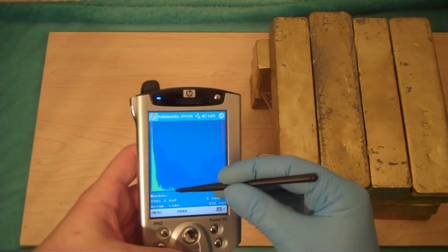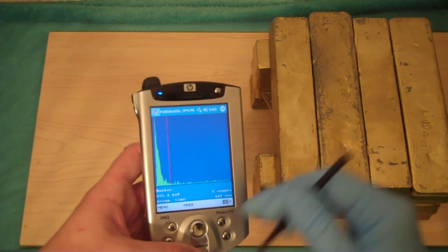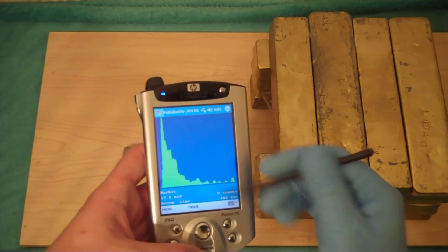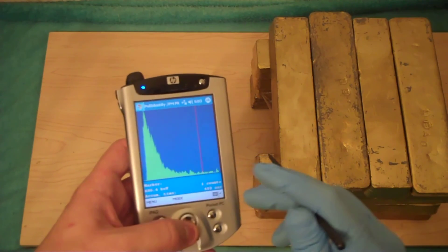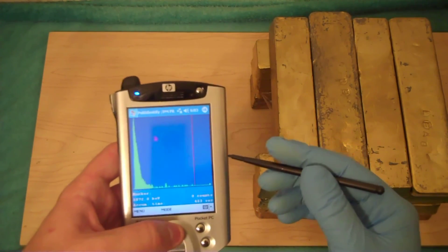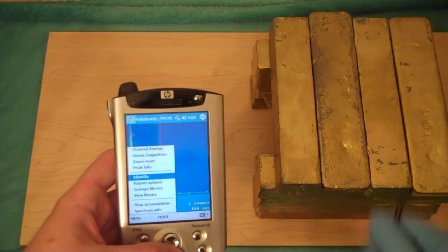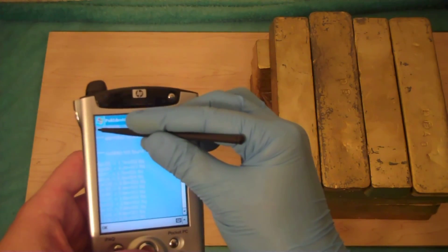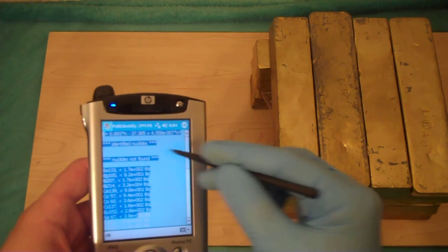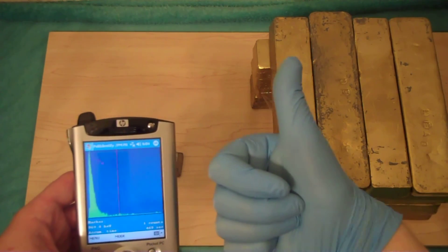Let's cover that back up and hide the caesium so it doesn't affect the reading. About 10-15 minutes later, as you can see, there's almost nothing there — just a few tiny peaks that probably come from uranium or something, which is very normal in your food. You eat about 400 micrograms of uranium a year anyway. Most of what you're seeing there is a lead X-ray peak — nothing to worry about. We can click identify and look: you'll see two lists — the top is where found isotopes would be, but as you can see if I highlight them, there's nothing there. The lower list shows isotopes that were not found. Thank you, Polymaster 1703-M01B — you're my favorite portable handheld gamma spectrometer.